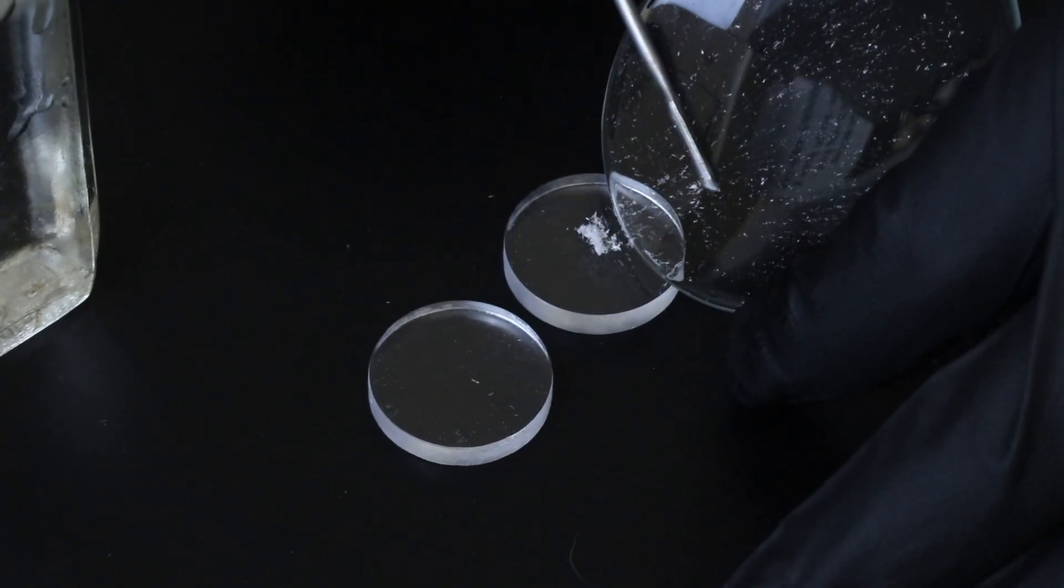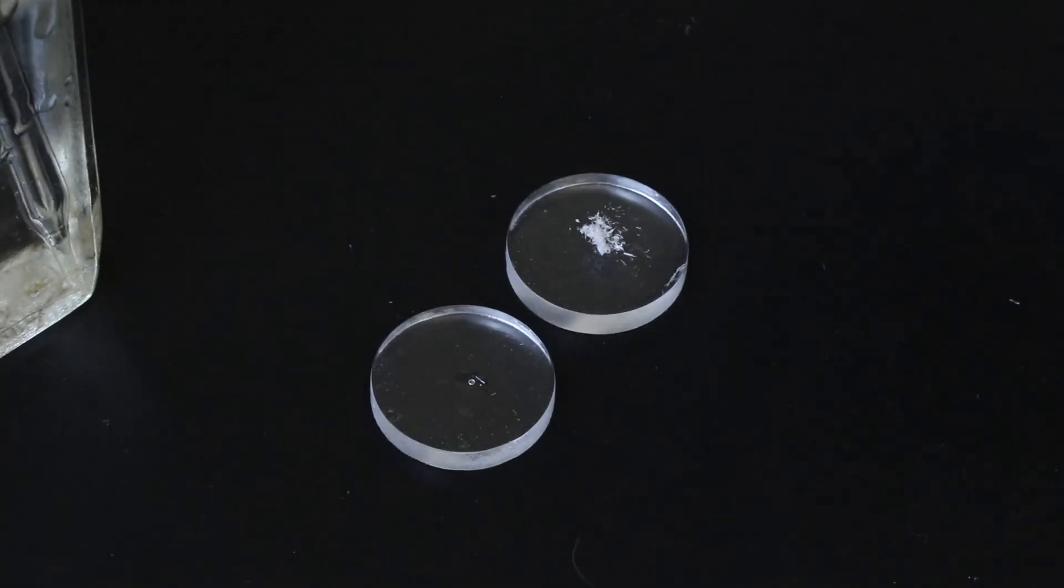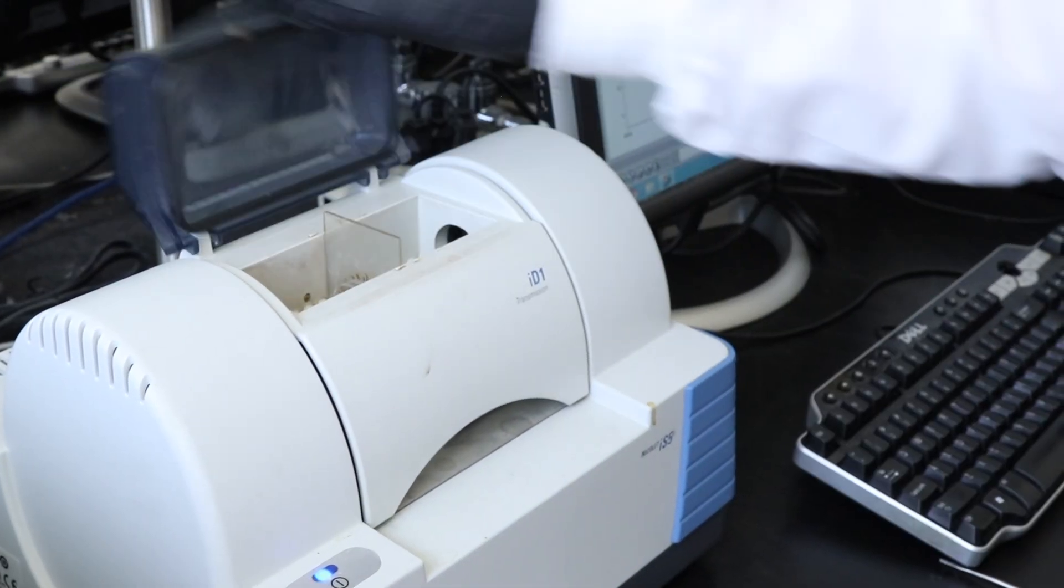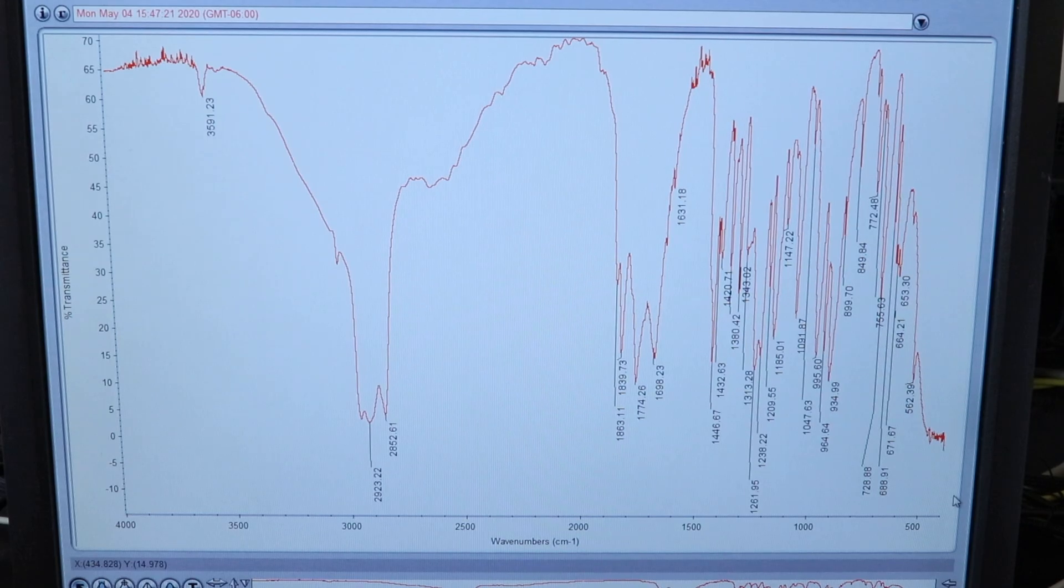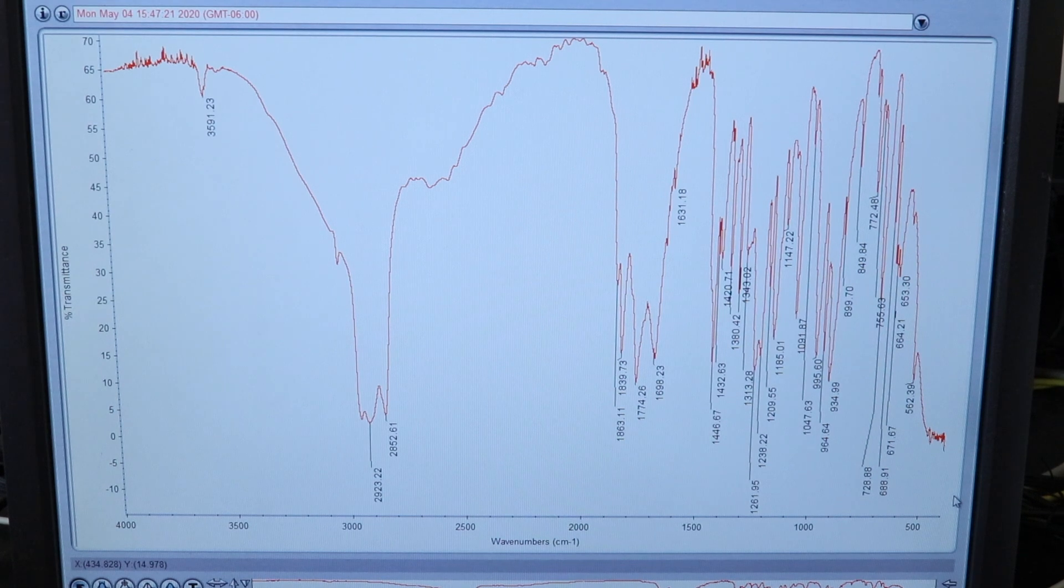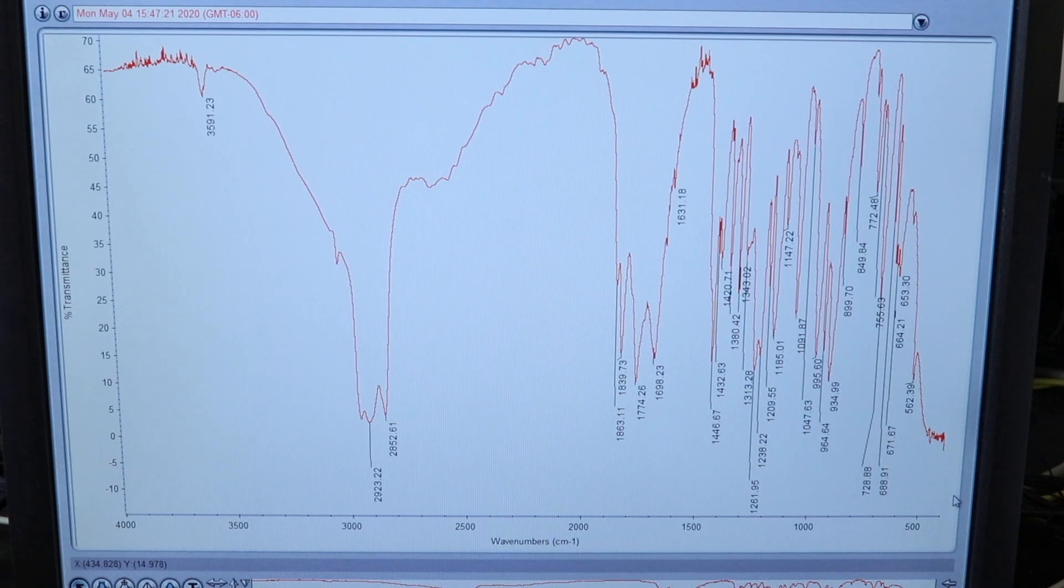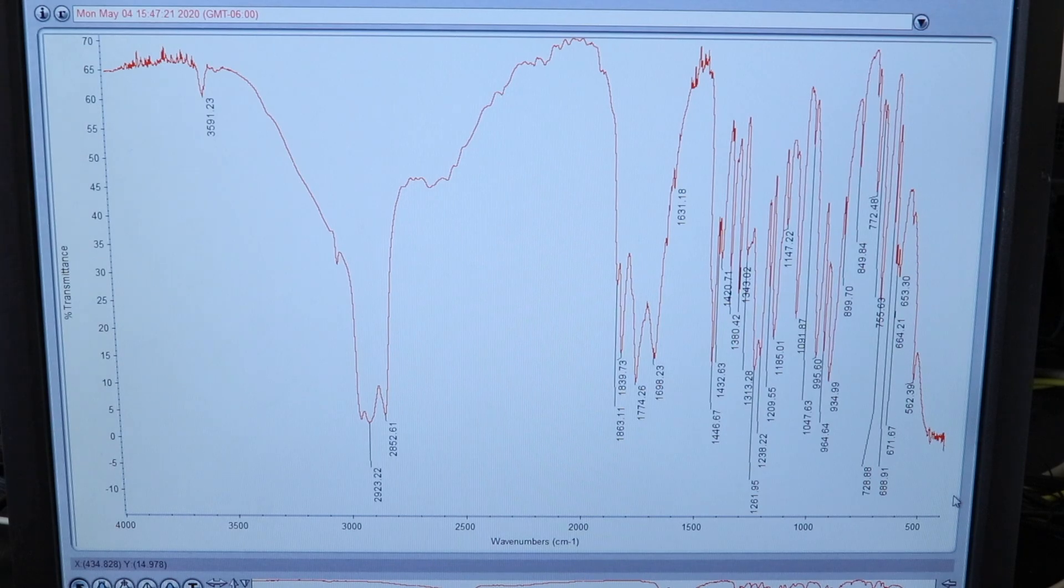I'll add what little product I have to the salt plates and then use the nujol mull technique to run the IR spec since it is a solid product. And there it is, there is definitely some diacid contamination in there. We can see the carboxylic acid OH and an additional carbonyl peak around 1698 it looks like, but we do see the two carbonyl peaks for the anhydride around 1840 and 1774, and that along with the melting point does indicate that the product was produced and was the major component of the crystals isolated.